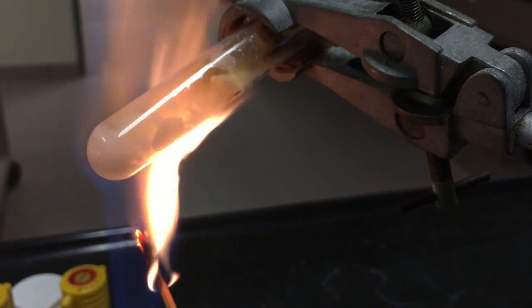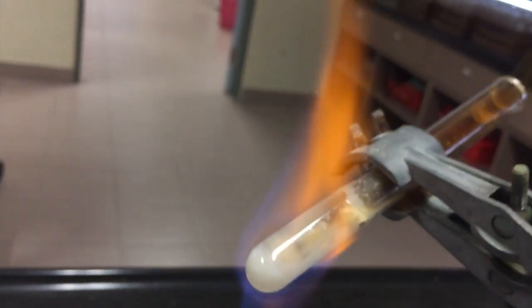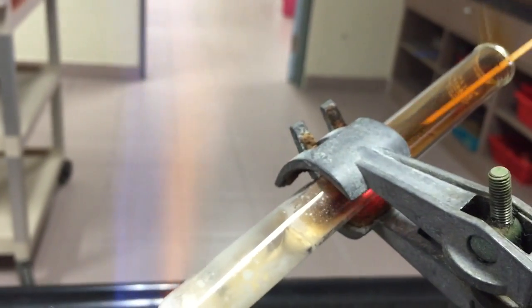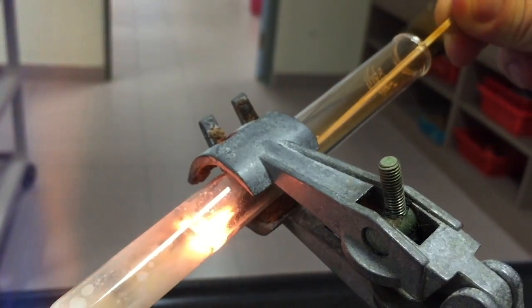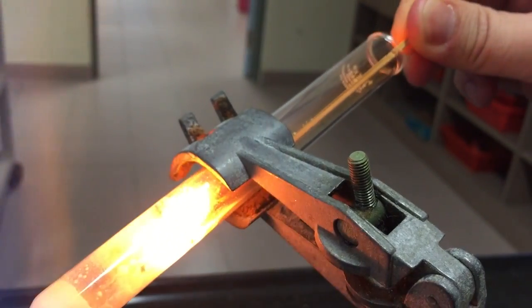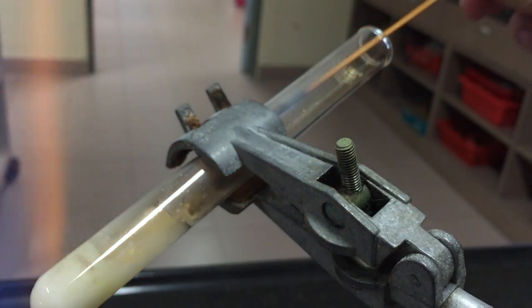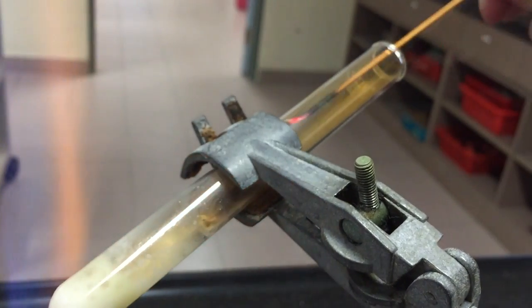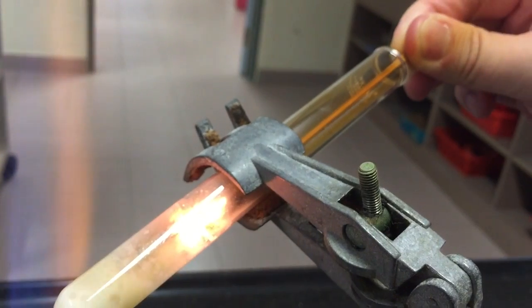We will now test for the presence of oxygen gas. Prepare a glowing splint and place the glowing end of the splint into the test tube near where the decomposition is occurring. Notice how the oxygen relights the glowing splint.